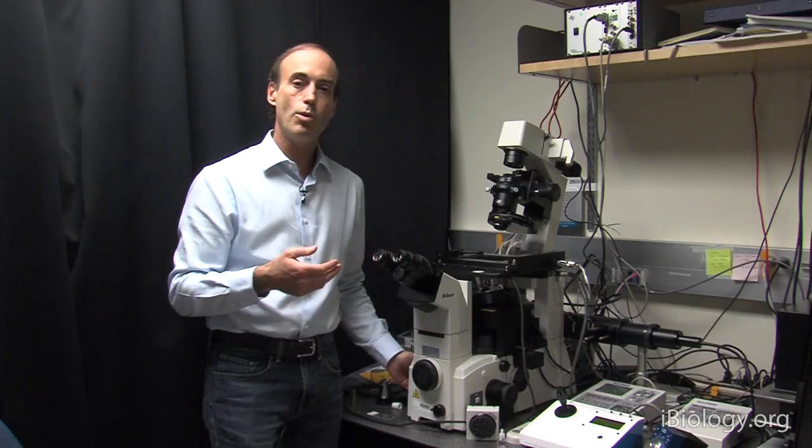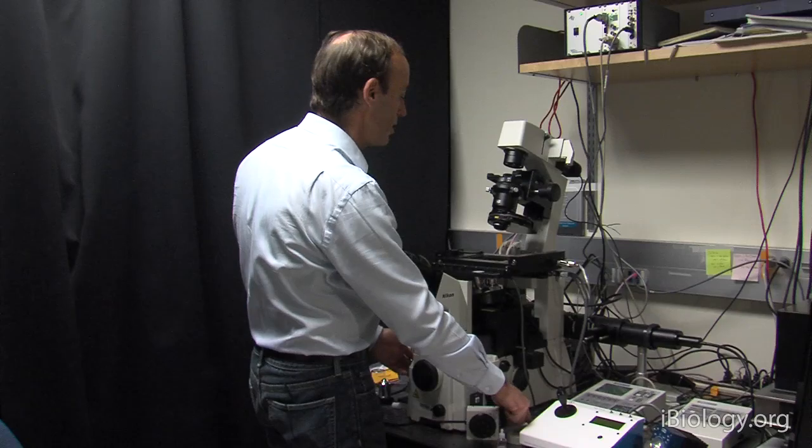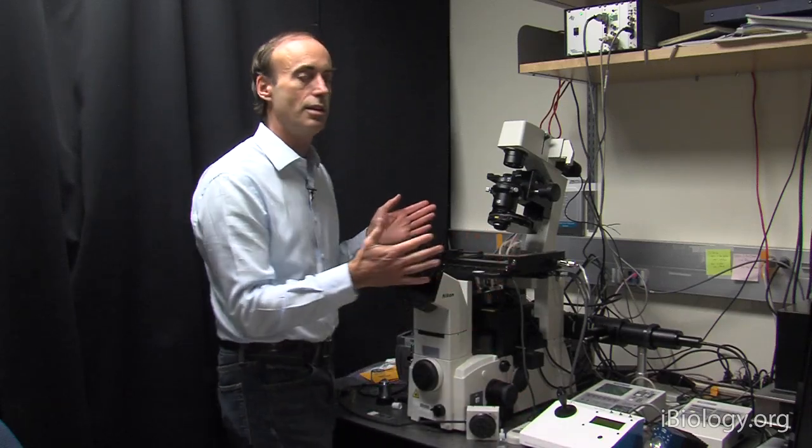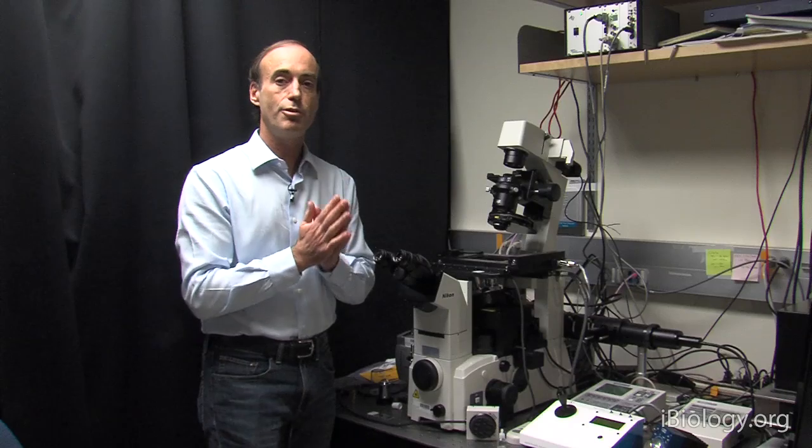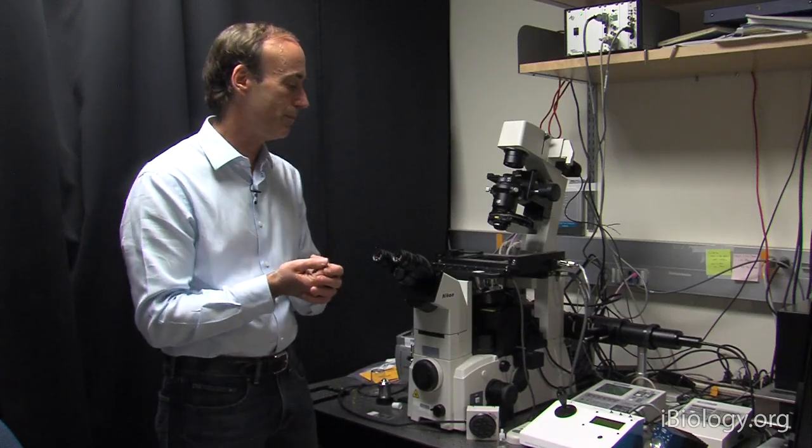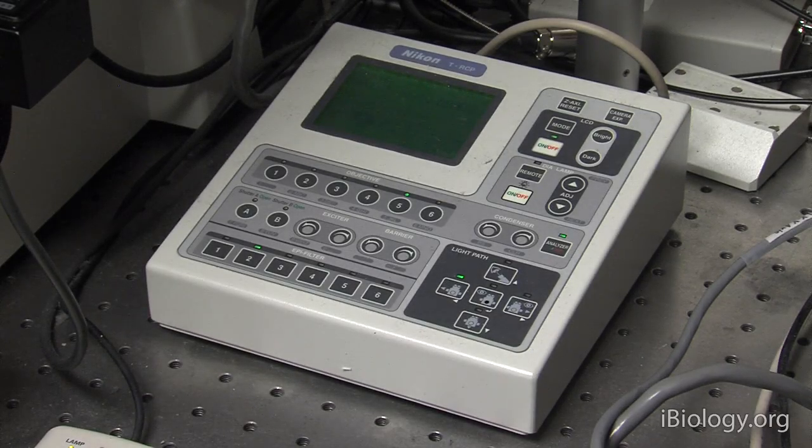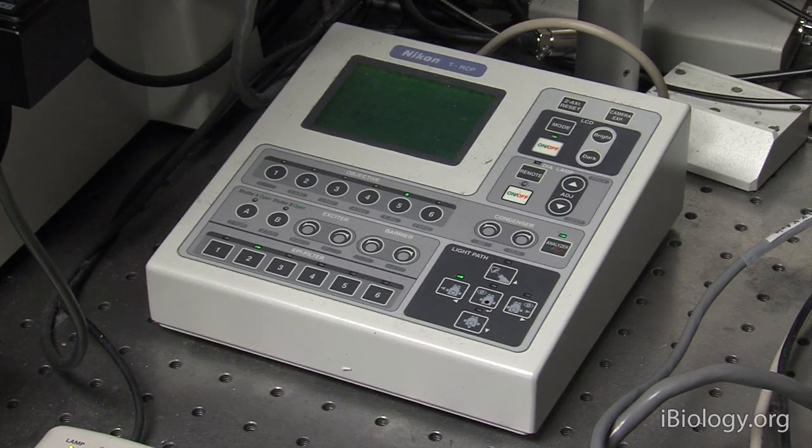Now, when I become familiar with this objective knob, I want to make sure that I have everything set up properly so that I can see the fluorescence from my specimen. Before you start focusing, you want to make sure that the light path of the microscope is set up correctly, so that the image is being projected to the eyepiece.